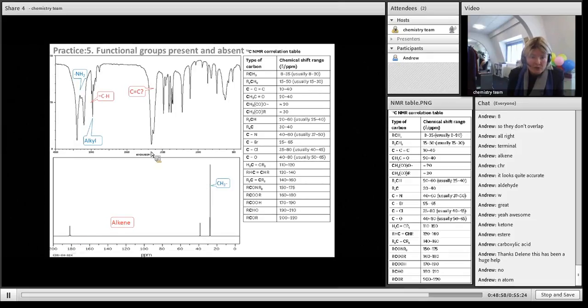And we know there's a carbonyl, it's an amide we've got here because of this. We know it's an amide because it's below 1700 as well, so mention that. Okay, we know that's not from an aldehyde or ketone because there's nothing over here. Right, so we can cross off all the others because there's no CO, so it can't be an ester.